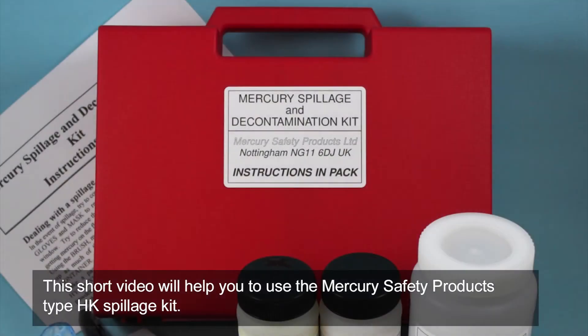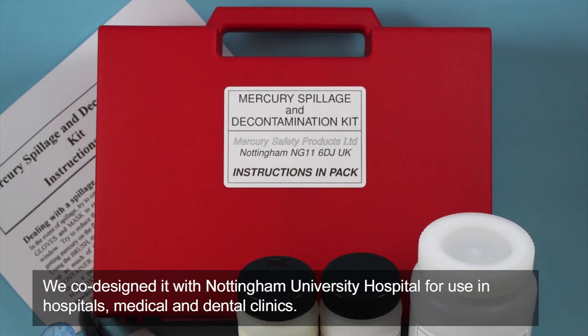This short video will help you to use the Mercury Safety Products Type HK spillage kit. We co-designed it with Nottingham University for use in hospitals, medical and dental clinics.